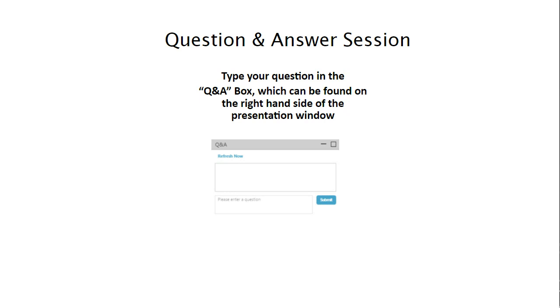where I think there's more attention being paid to this because there may be quality attributes associated with it, but I don't think they've been fully explored. Clearly, looking at acidic and basic variance is something that has been appreciated for a longer period of time.